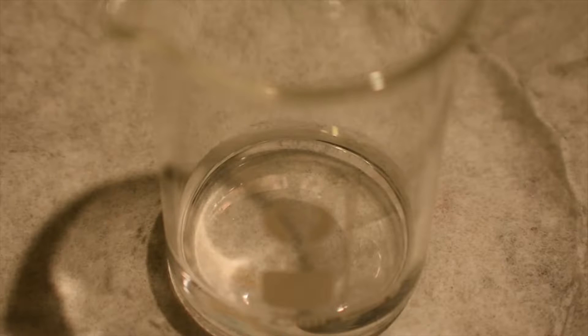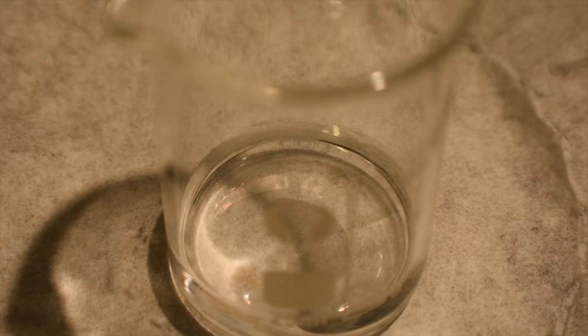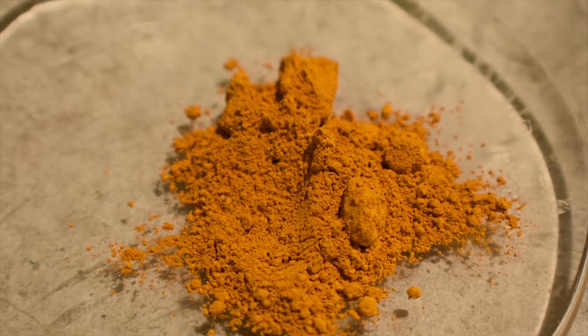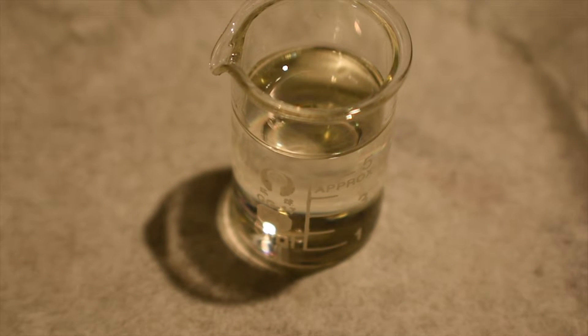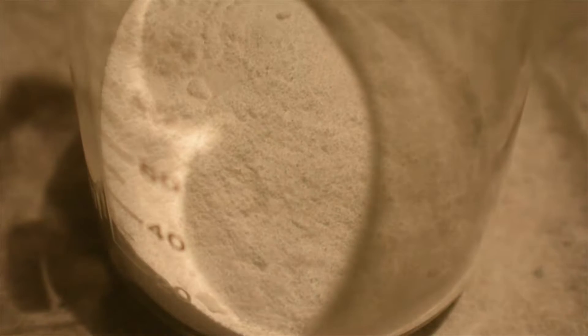You will need to measure out 5 milliliters of distilled water, sulfuric acid — I'll put the recommended amount up on screen. You will also need 2.5 grams of Vanadium Pentoxide, 12 milliliters of ethanol, and 6 milliliters of acetylacetone. You'll also need some anhydrous sodium carbonate, about 20 grams should do just fine.